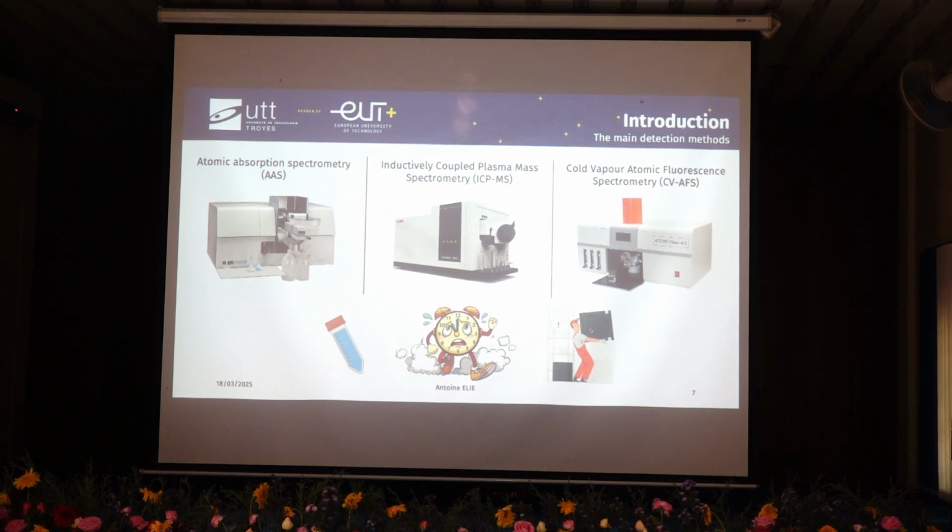The first one is that you need to sample a solution, so you lose information depending on where you make the sample, and between two samples you have no information. The second one is the fact that this technique is relatively complex and time-consuming. And the third one is that it's a relatively heavy machine, so you put it in a laboratory and it stays here during a few years.